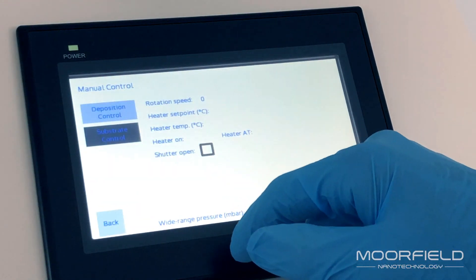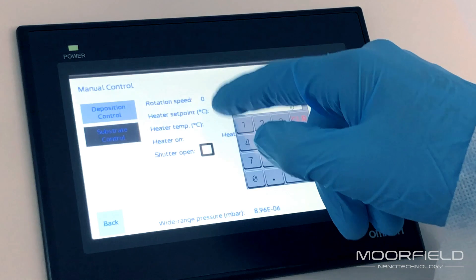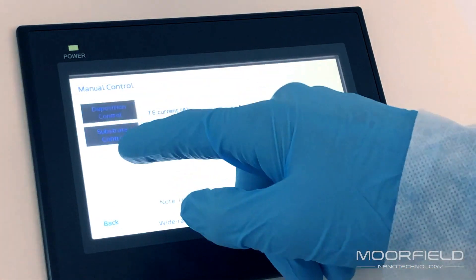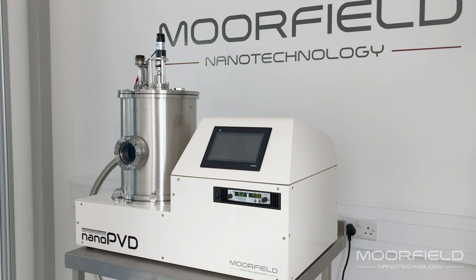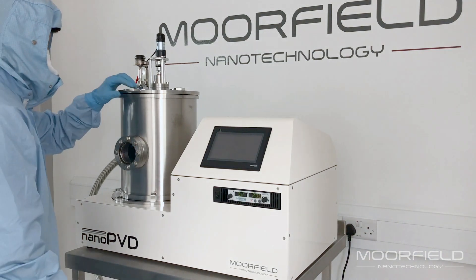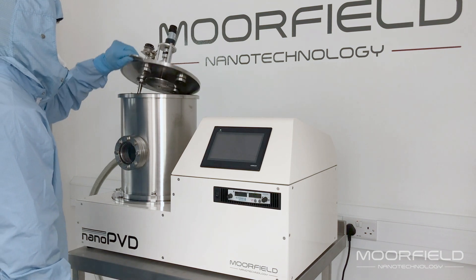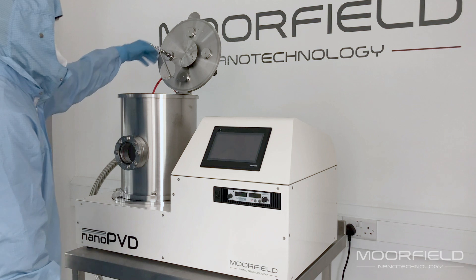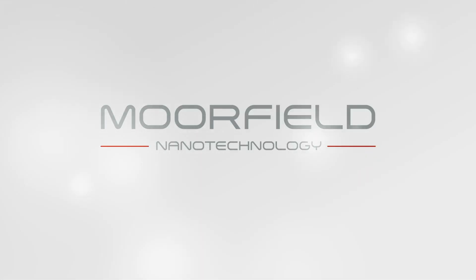Control is manual or automatic through a powerful but easy-to-use interface supported on a touch screen HMI. All nano PVD tools have minimum service requirements, are quick to install, easy to maintain, and are fitted with comprehensive safety features. For more information or to discuss your project, please contact us today.